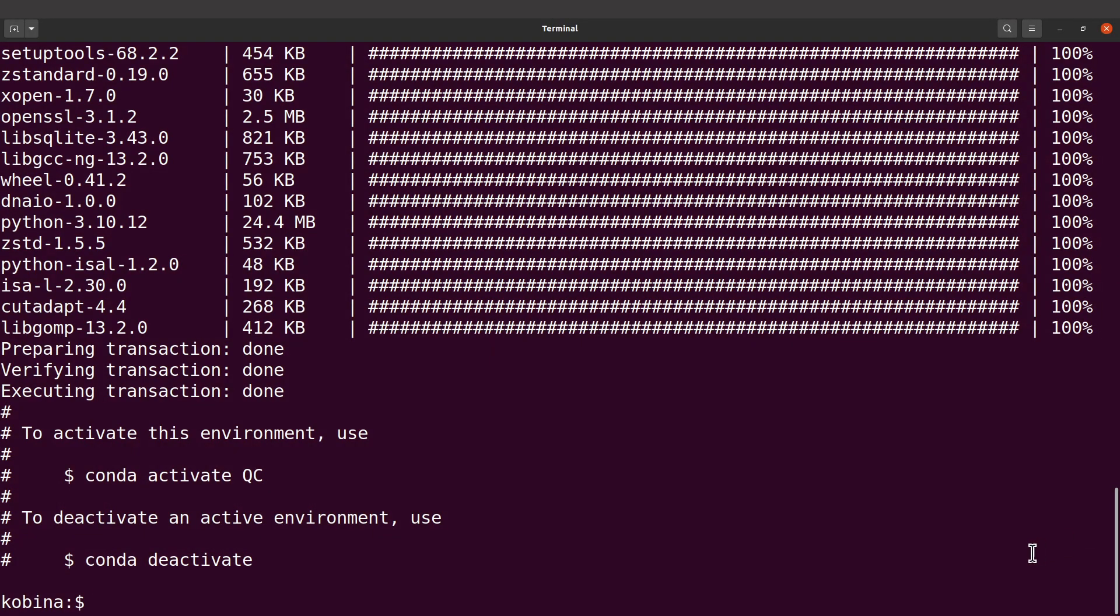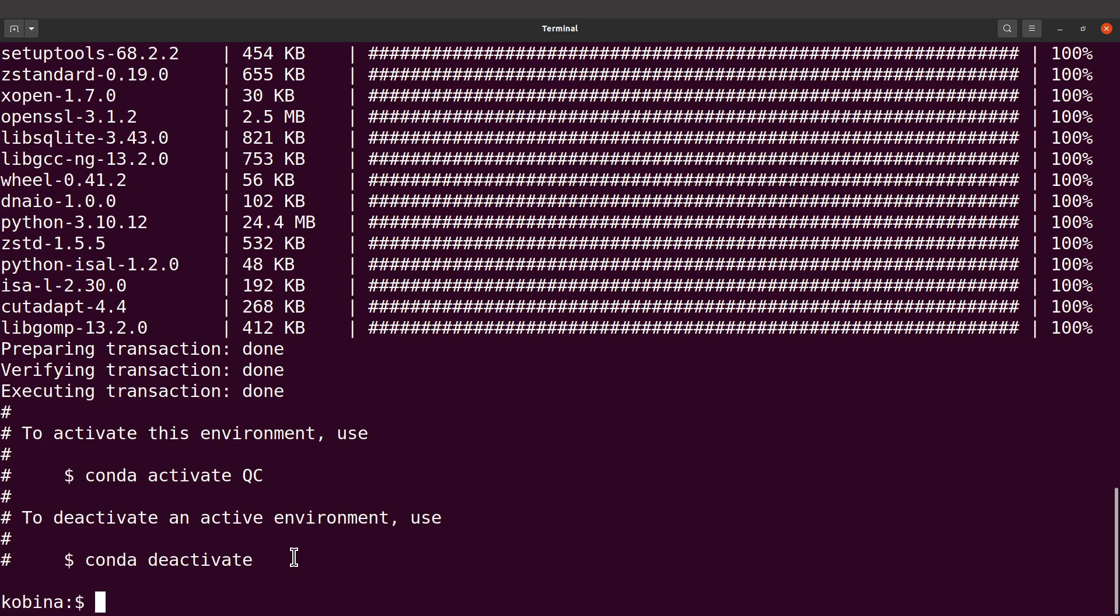Okay, Cutadapt has been installed. If everything is okay then you will see this message coming up with instructions for activating and deactivating the environment.